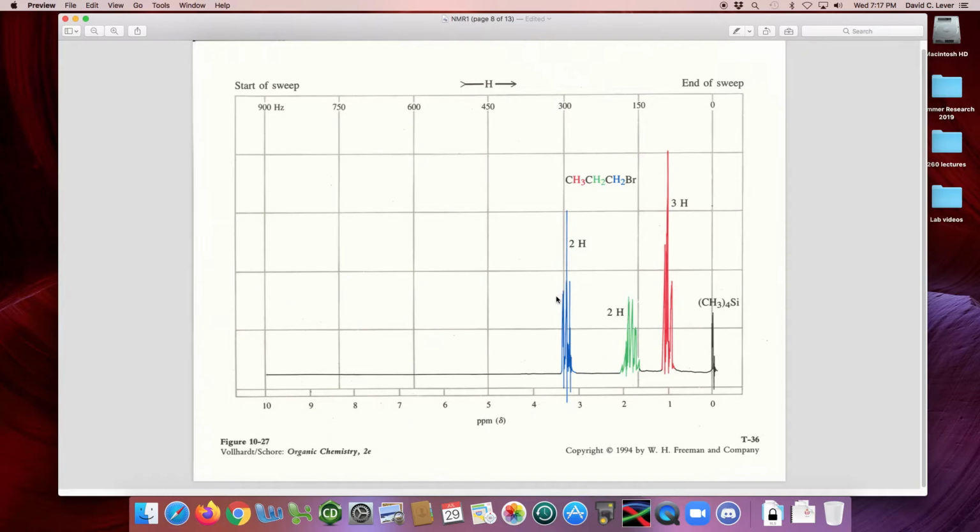Notice it leans upfield. The lean is more pronounced here than it was in the 300 megahertz spectrum run digitally. The lean downfield is more pronounced on this upfield triplet, on the one that's run using an actual scanning pen as opposed to a digitization.